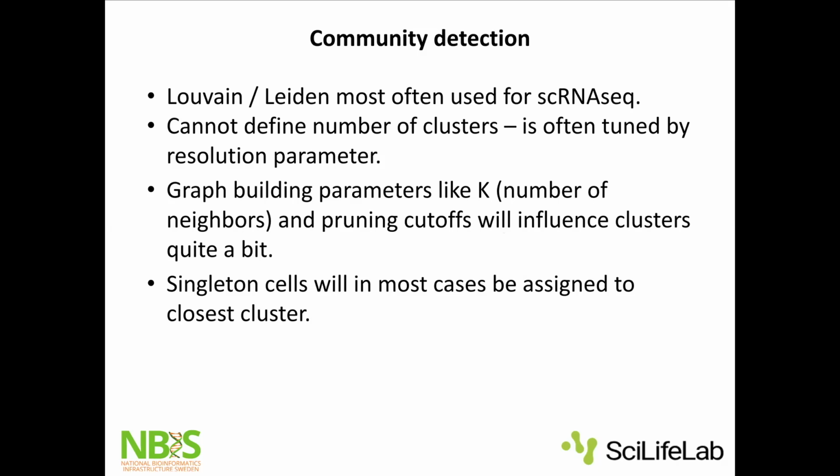What is completely hidden in these algorithms or the way they're implemented is that you will quite often have singletons, so cells that are completely disjoint from the graph, especially after pruning in Seurat, and they will just be pushed into the closest cluster, whatever cluster they're most similar to. There is an option to instead remove them, but that's not the default.